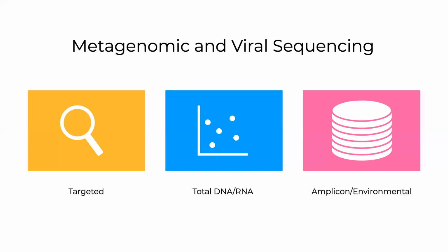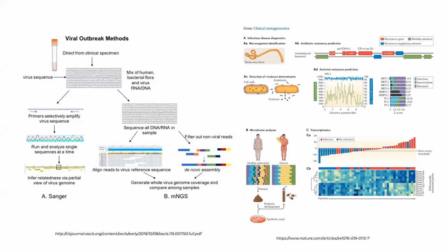Those techniques have been evolving over time and have been originally used only for research purposes, but in recent outbreaks, those have already started to be used in a clinical sense. And in the clinical sense, it all started around the time of the recent outbreak of the Ebola virus in 2014-2016 outbreak in West Africa. During that time, groups of World Health Organizations and other types of health organizations were sequencing on the spot genomes that were extracted from patients.